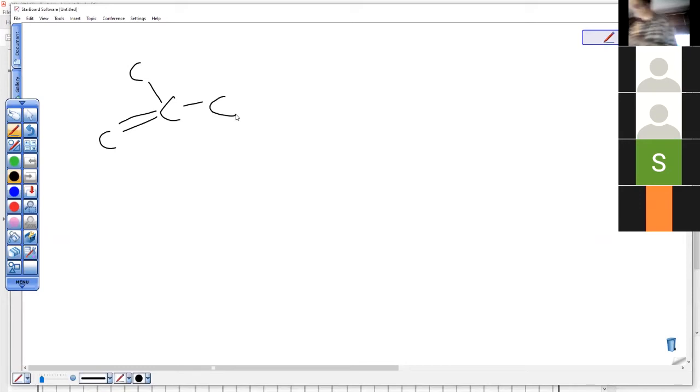Okay, so we got a carbon, and then what else do we have? Those 2 carbons with a single bond have 3 H's on them. Each is CH3, CH3. And the carbon at the end of the double bond also has an H. It's a CH. And there's something else on there too, an R group. It doesn't relate to my question. It's not a hydrogen, so that's important, but for this specific question you don't care what it is. Oh, and I forgot to put the 3 on this one.